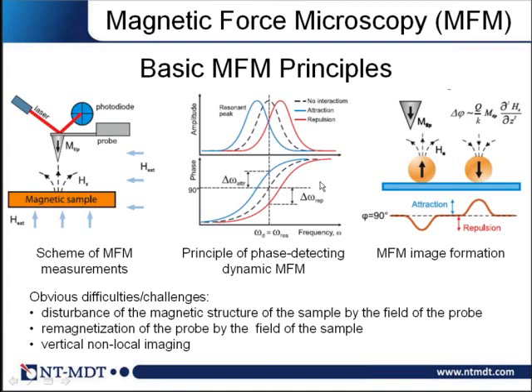Above 100 degrees, it's a big problem, and of course, you cannot get such a strong magnetic field as at ambient temperature.